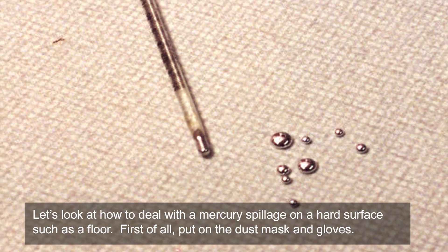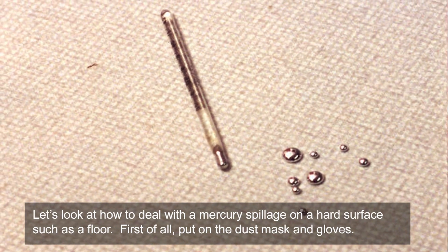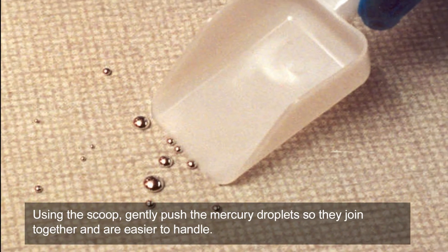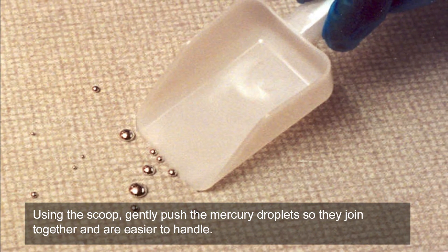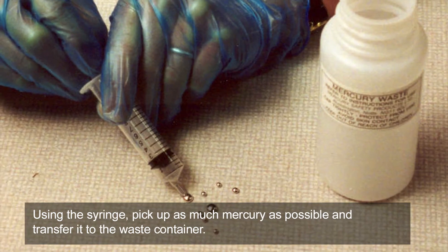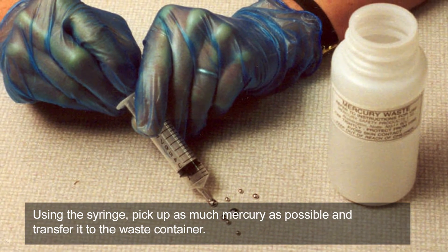Let's look at how to deal with a mercury spillage on a hard surface such as a floor. First of all, put on the dust mask and gloves. Using the scoop, gently push the mercury droplets so they join together and are easier to handle. Using the syringe, pick up as much mercury as possible and transfer it to the waste container.